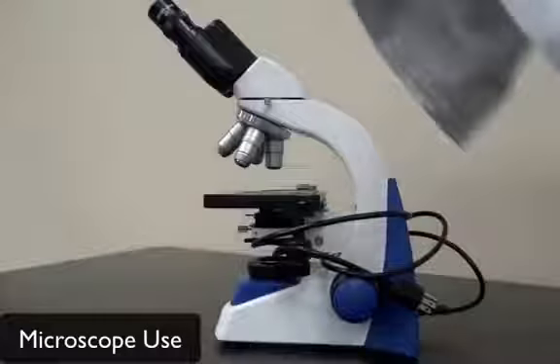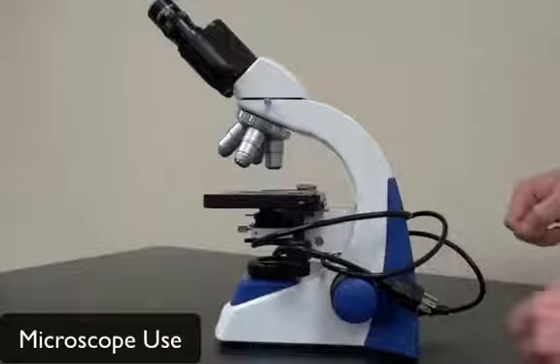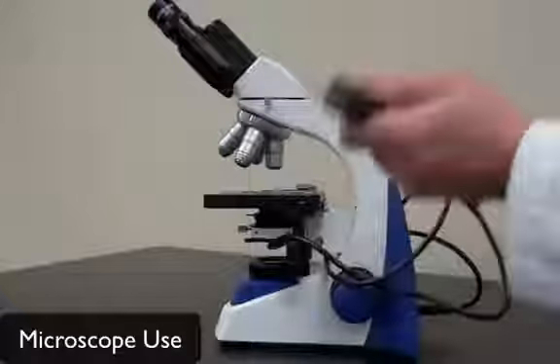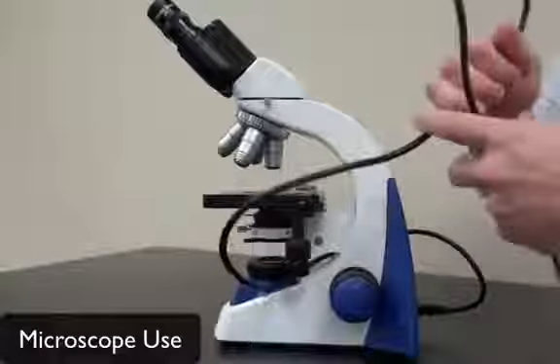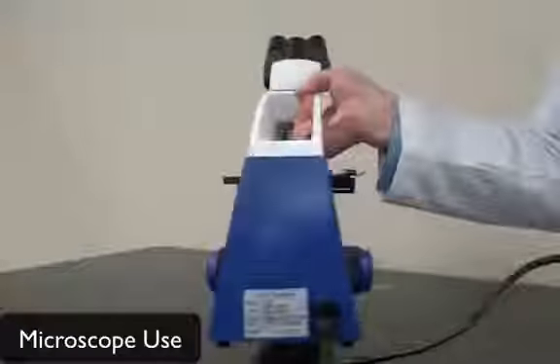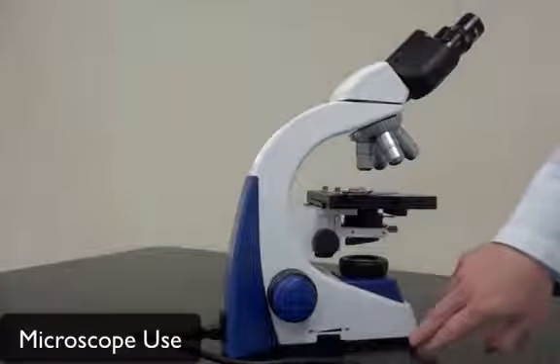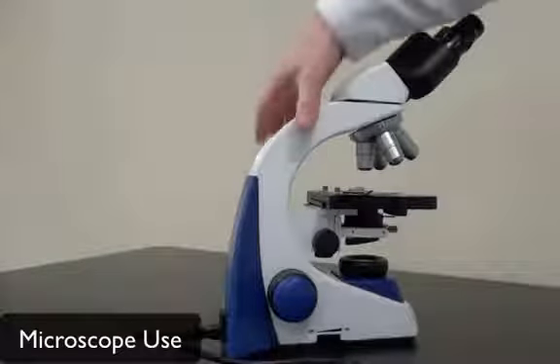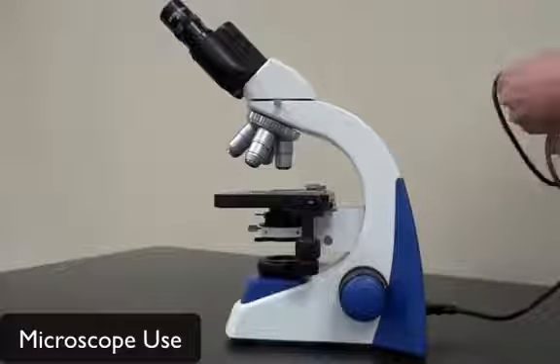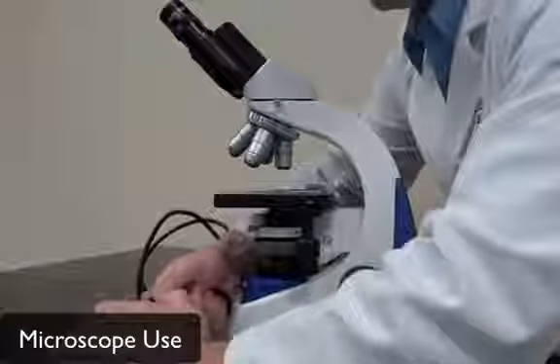And then when it's set down, you can remove the little protective covering, and you'll notice the cord is wrapped around the microscope. You can carefully unwrap that, making sure you don't swing it around and hit anything. And before you plug it in, the one thing that you want to make sure is that the lighting source here is off. And if you have an intensity dial, make sure that intensity dial is at its lowest setting. We don't want to harm the bulb or burn out the bulb. If that's all set, then you can plug in your microscope to the appropriate socket here.